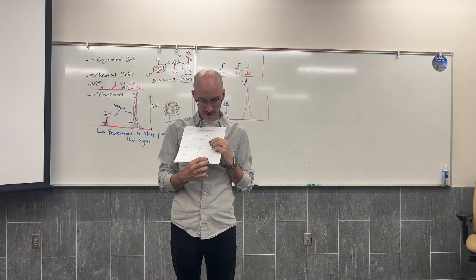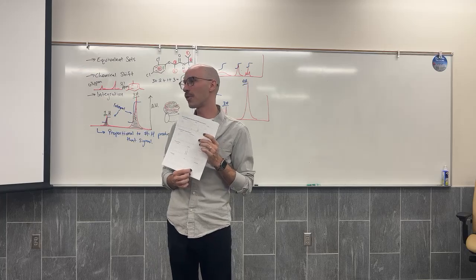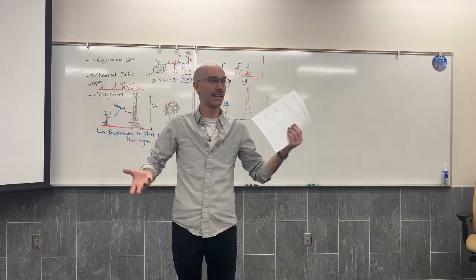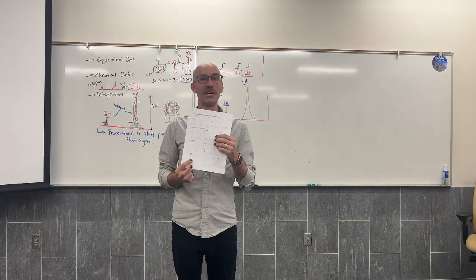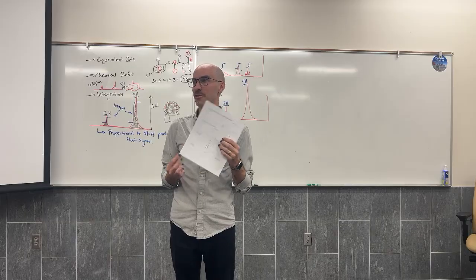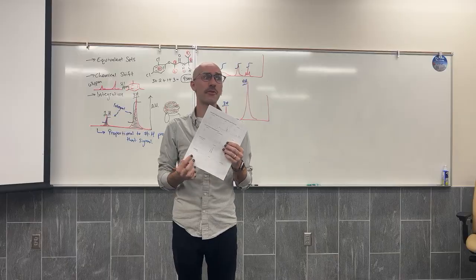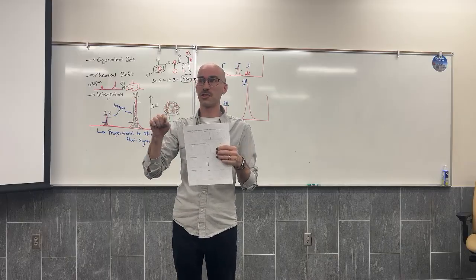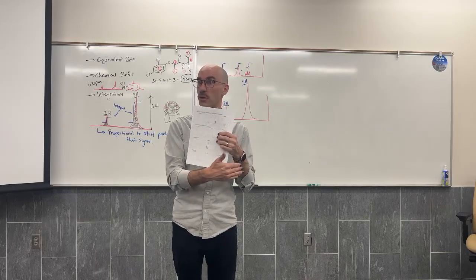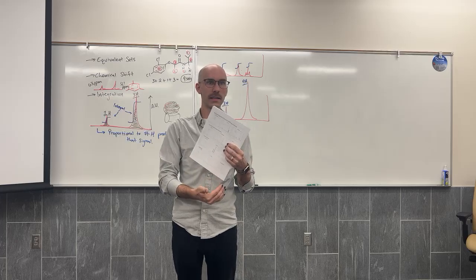And then I have hexamethylbenzene, once again, 1 signal. How would the instrument know to integrate that to 18H? It wouldn't. It doesn't even have anything to balance it off of. So these are the most challenging integration examples. Terrible integration examples, sorry, because the instrument would never even know. But what I'm showing you is that I'm not going to trick you by saying 1H, 1H, 1H. That's the lowest proportion. I'm going to give you what the actual integrations should be.